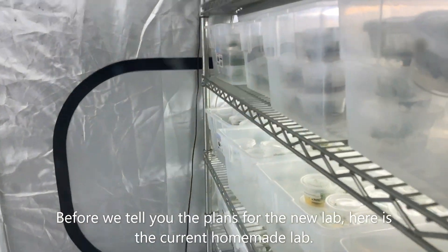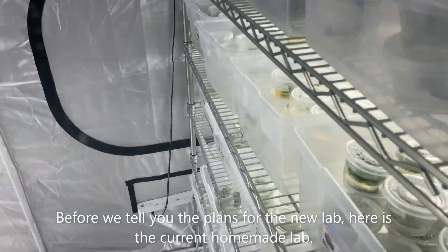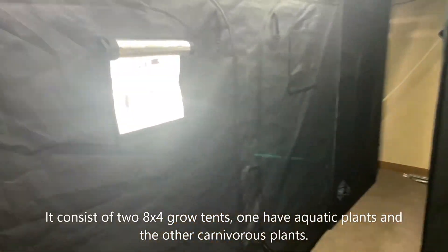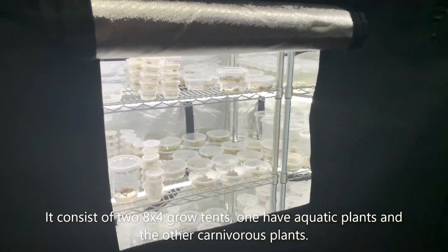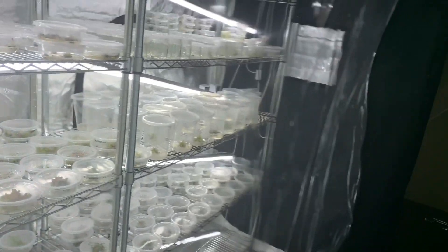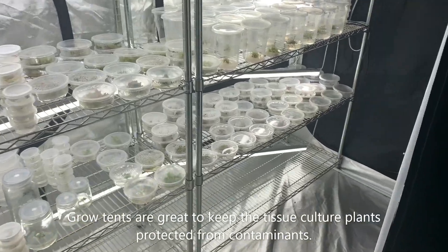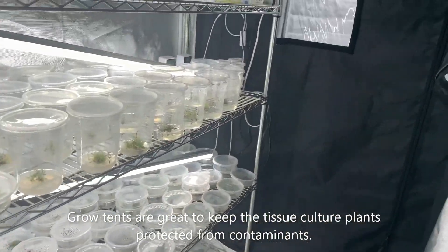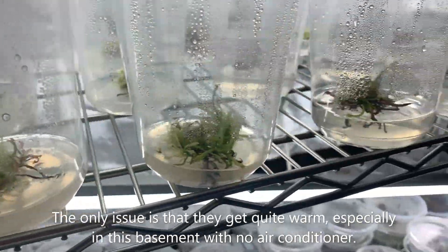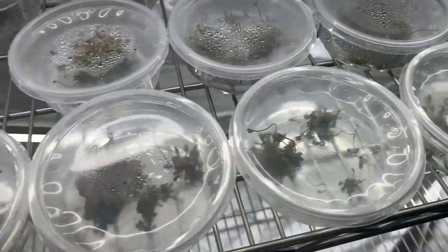First, let me show you our current setup before we get to the good stuff. Right now we have two 4x8 grow tents — one for aquatic plants and one for carnivorous plants. Grow tents are always ideal to keep contaminants out of tissue culture plants. The setup we have now is actually perfect for our plants other than it's in the basement.